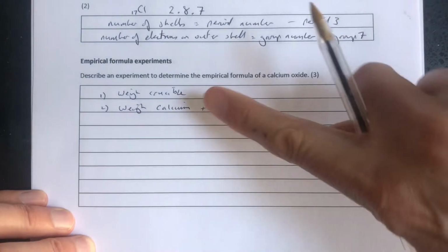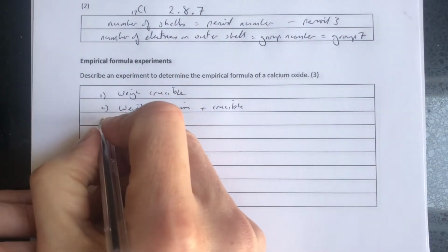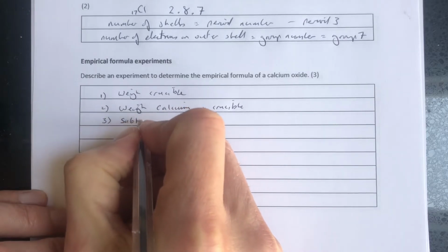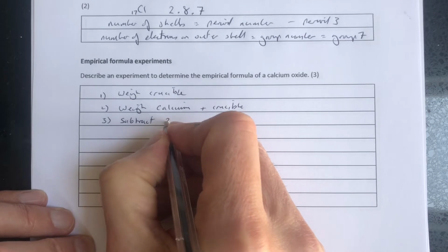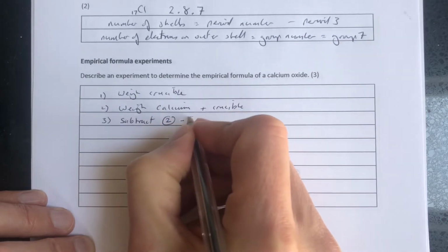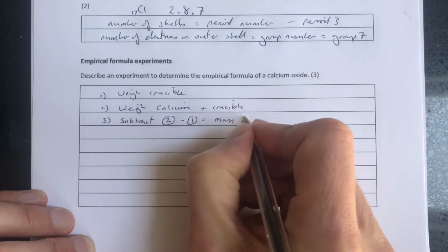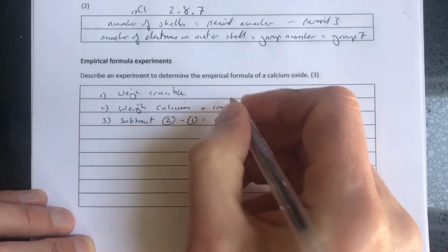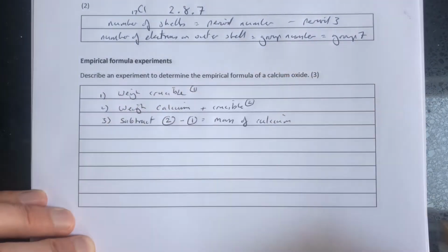So if we subtract the crucible, take the crucible away, we just get the mass of the calcium. So subtract 2 minus 1, and that's going to be equal to the mass of calcium. So that is the 2 mass, and that is the 1 mass.